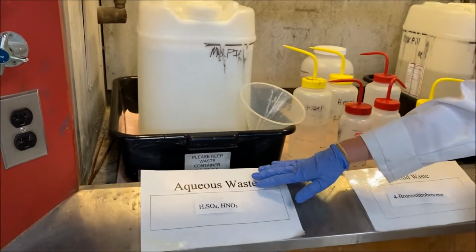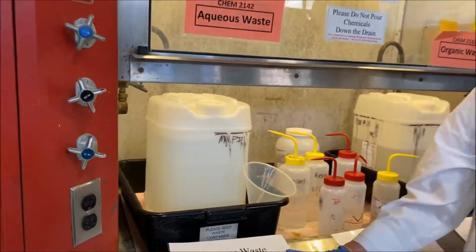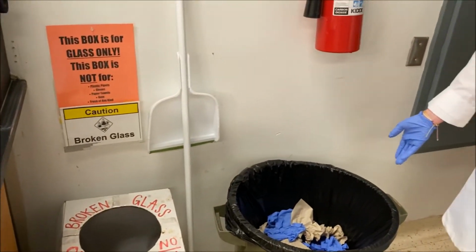Right past here we have our aqueous waste, which is again labeled in two positions, and it'll be right back here where you can throw your aqueous waste. Other than this, we still have our broken glass box right here, and then our general trash can as well.